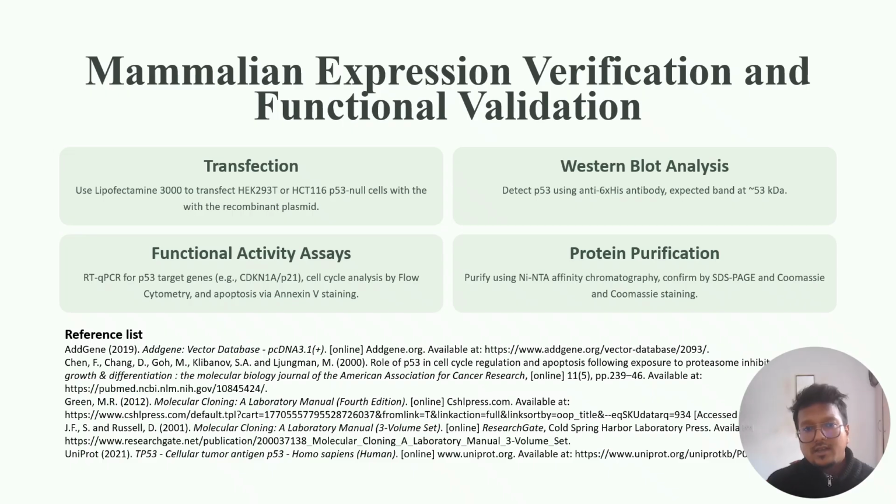In conclusion, I successfully designed and validated a p53 expression vector. This system allowed me to study how p53 controls the cell cycle and apoptosis, which is very important in cancer research. And here are all of my references.